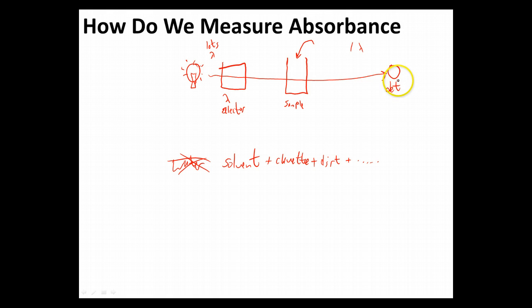And we're going to look at how much intensity I'm seeing from that light. So the detector looks back and says, aha, I'm at some power. We'll call that P naught. That's my original power that I had.